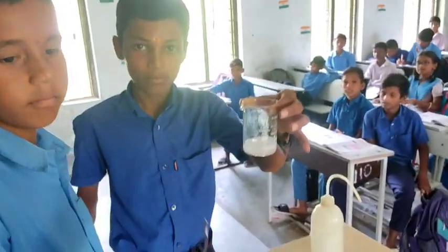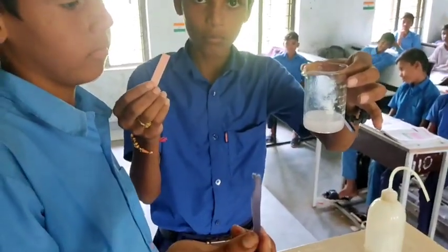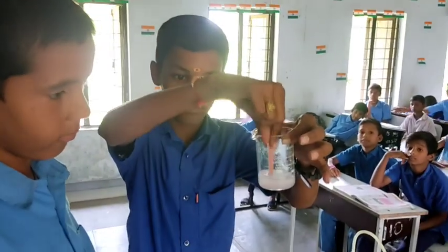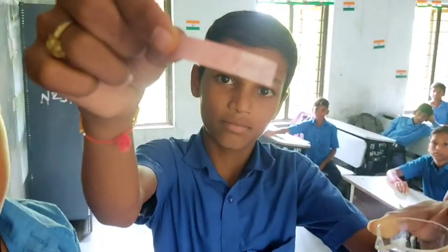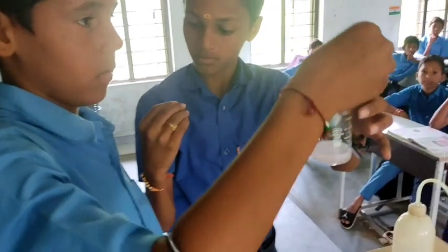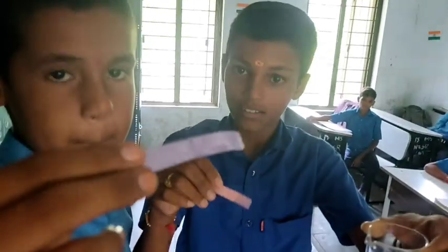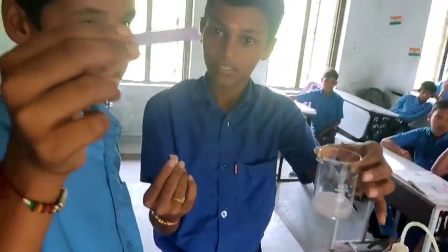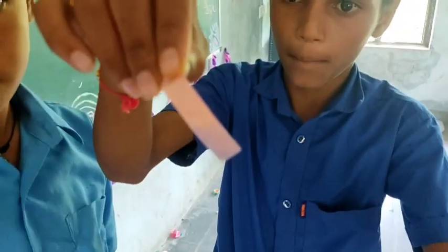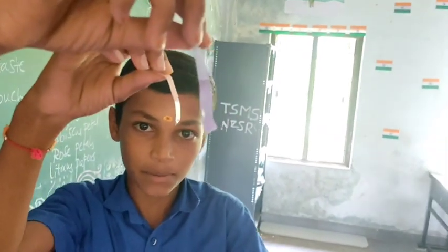Now we have taken the Soap Solution. First we dip the Red Litmus Paper into the Soap Solution — it is changing into blue color. Next, the Blue Litmus Paper remains blue. So here we can say that the Soap Solution is basic in nature: Red Litmus changes to blue, and Blue Litmus remains blue.